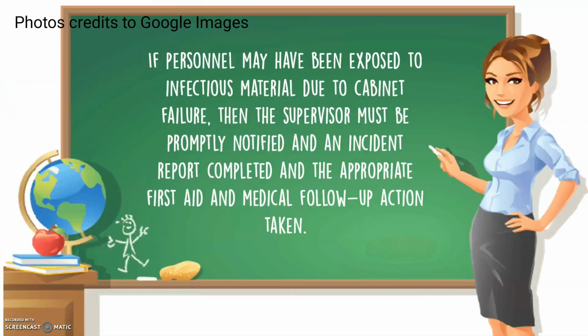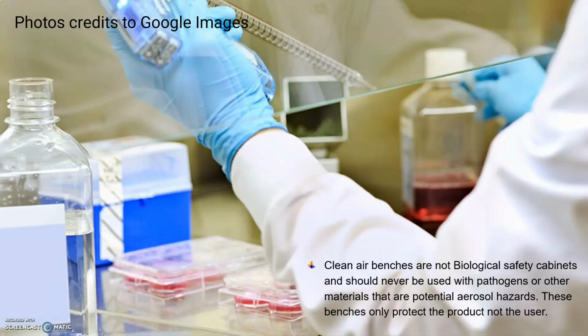If personnel may have been exposed to infectious material due to cabinet failure, then the supervisor must be promptly notified, and an incident report completed and appropriate first aid and medical follow-up action taken.